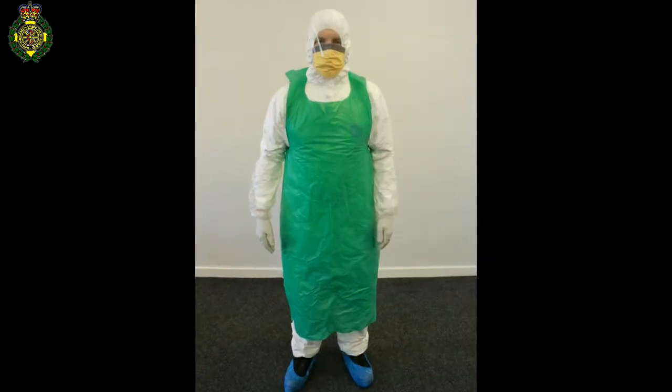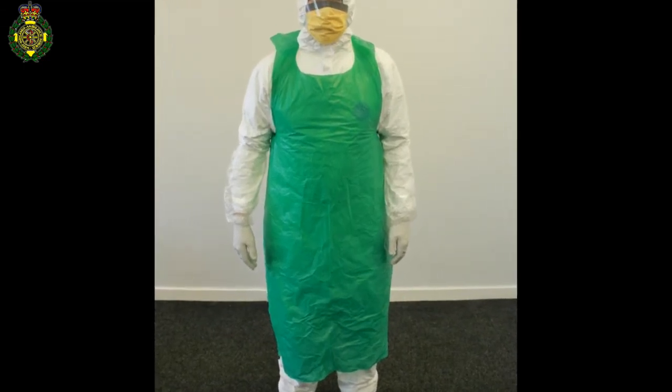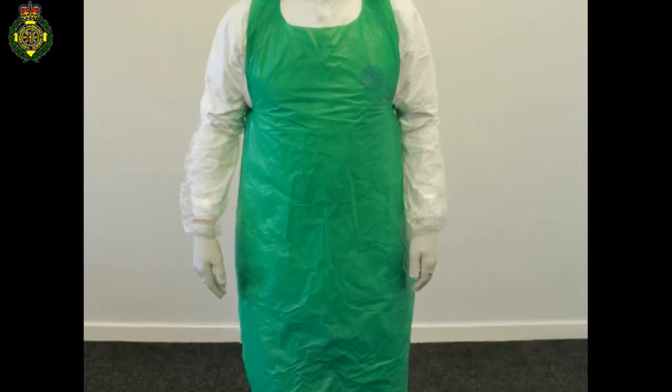Once you have any PPE on, always remember that the PPE is going to have contaminated areas on it. So anything that touches the PPE is also going to be contaminated.